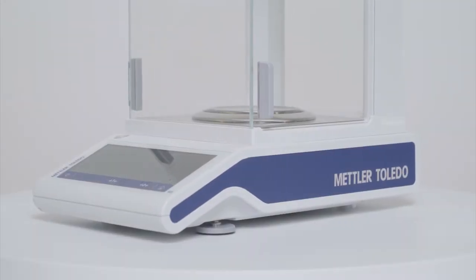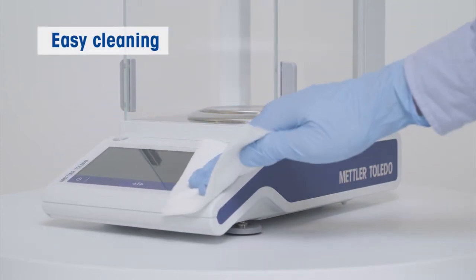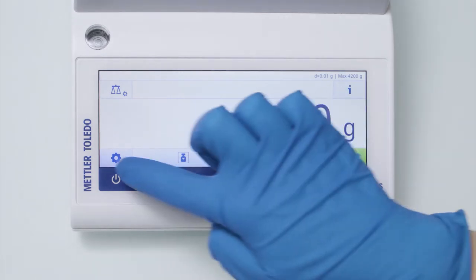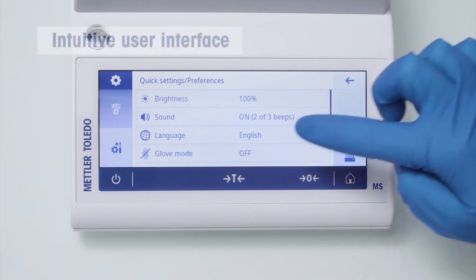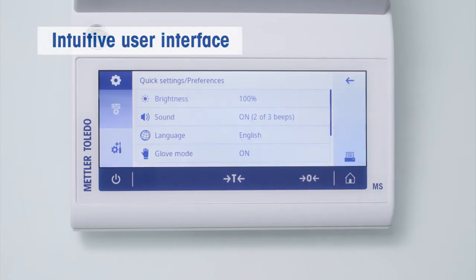The housing surfaces of the balance are large and flat, the corners are rounded, making them very easy to clean. The large 7-inch color display is swipe-sensitive and offers a user experience that we are used to from tablets or smartphones, even when wearing laboratory gloves.